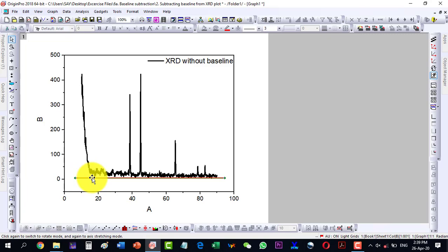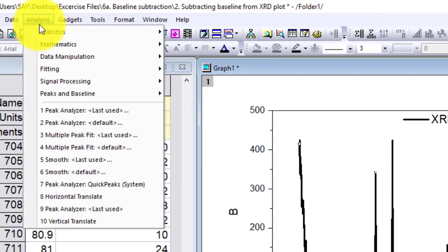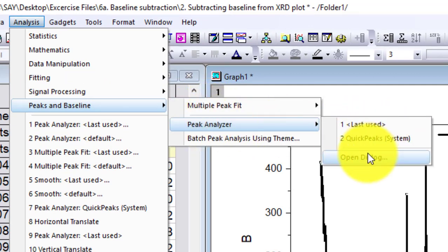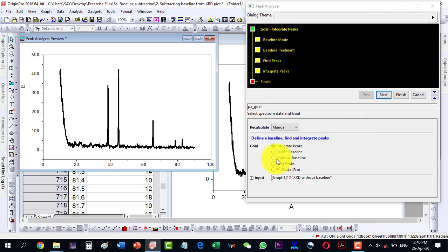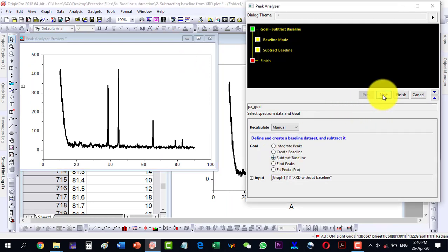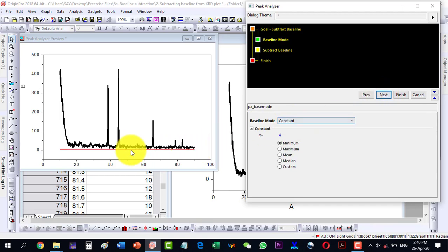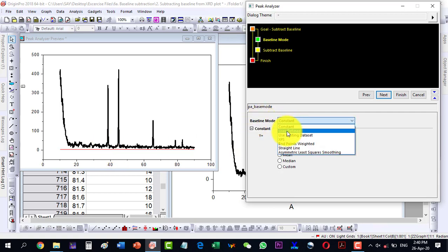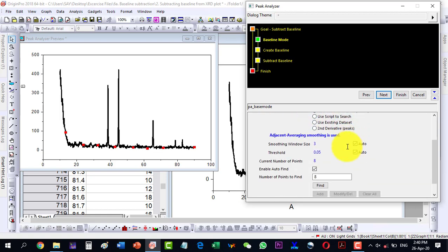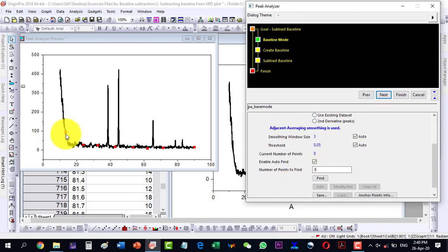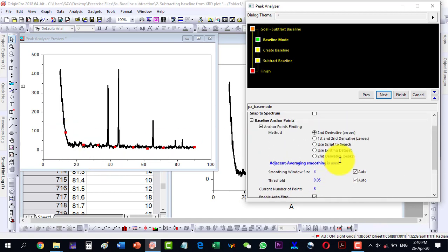We will have to correct this data. Select the plot, then go to Peaks and Baseline, then Peak Analyzer and open the dialog. We have the preview here. Go to Subtract Baseline, then click Next. Here we will select the user-defined constant mode — this uses second derivatives and eight points which are already marked.